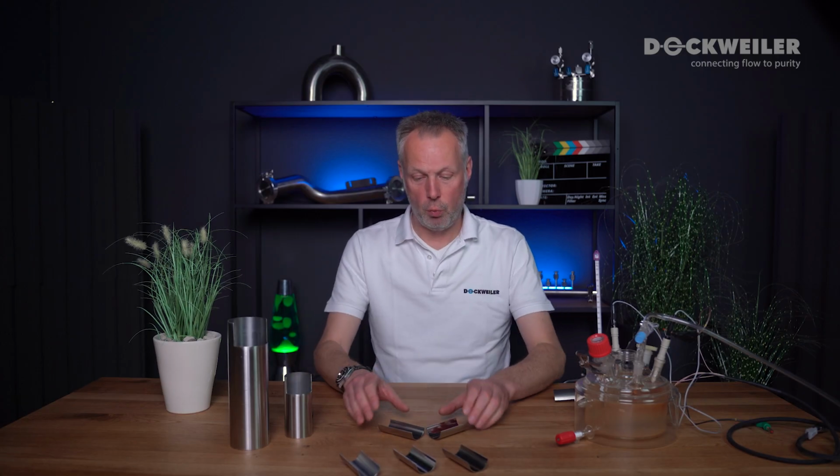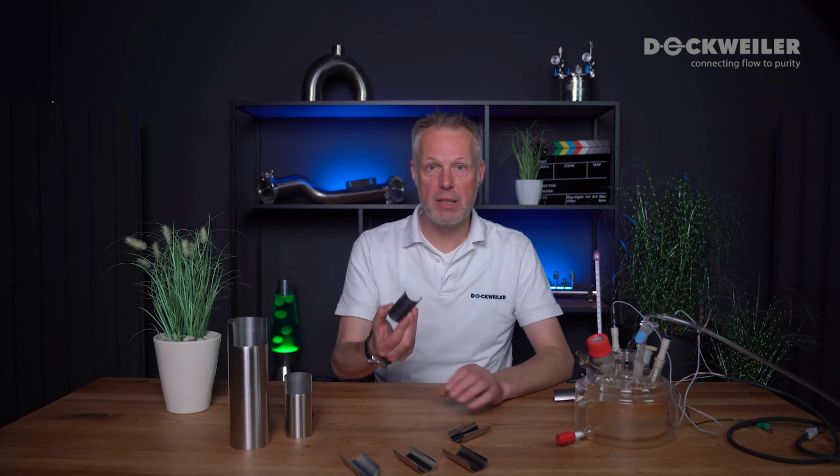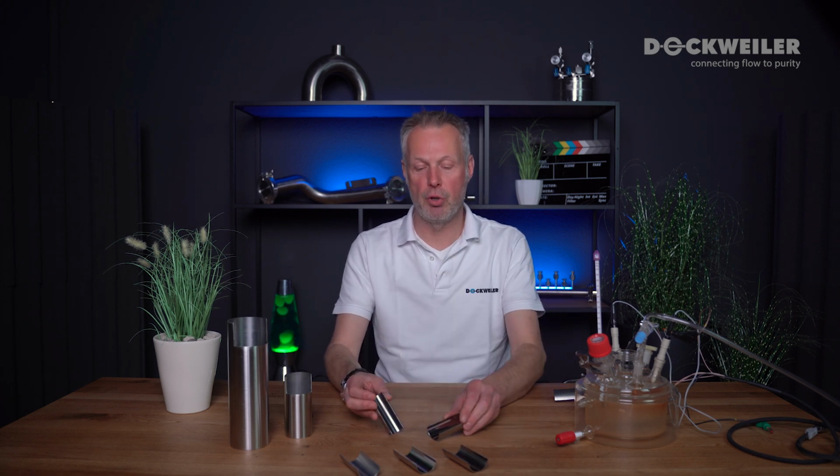However, what we don't want to do is a CPT testing. We want to do a CPP testing. And CPP at this stage means critical pitting potential measurement. So what we don't want to vary is the temperature. We want to keep it constant. And we want to vary the potential. And in order to do it, we need to create specimens out of the untreated sample and the electropolished sample.